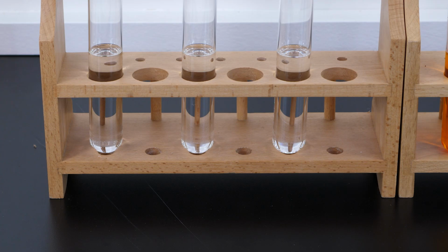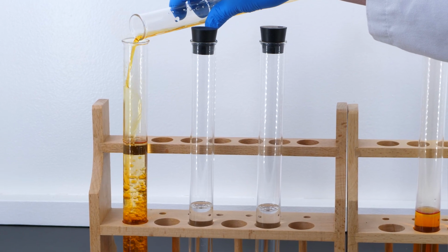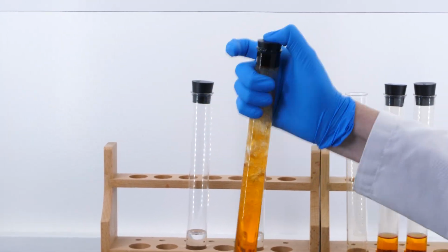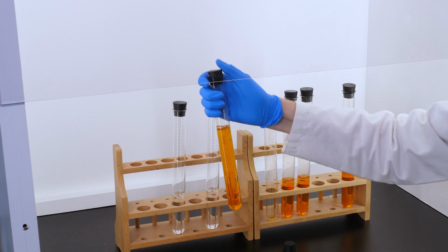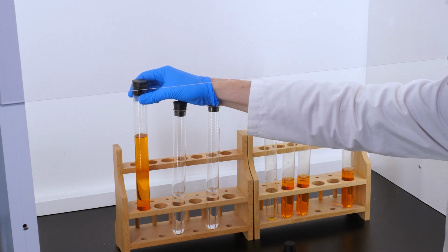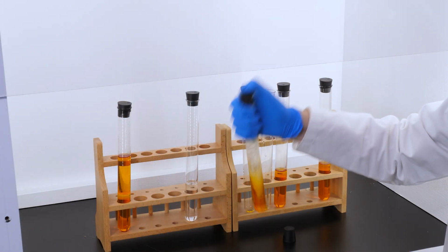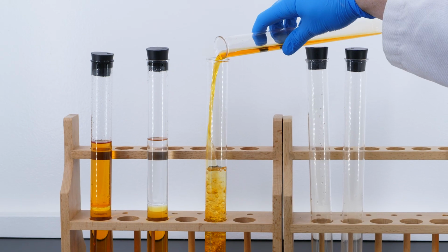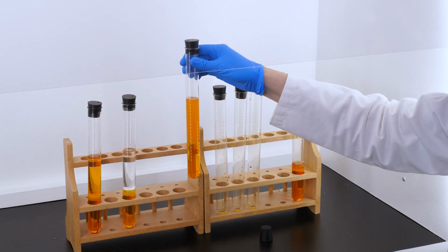Let's see what happens when we add bromine water to cyclohexane. We add bromine water to the test tube containing the cyclohexane and shake to mix the contents. Then, we place the test tube back in the rack and wait to see if any chemical reaction occurs. Next, we repeat these steps with the test tube containing cyclohexene. Finally, we repeat the steps with the test tube containing benzene.